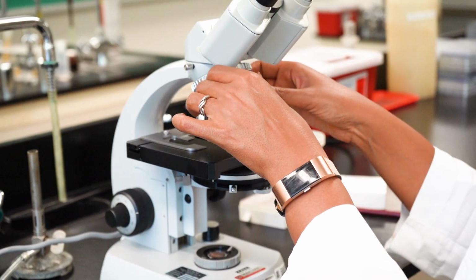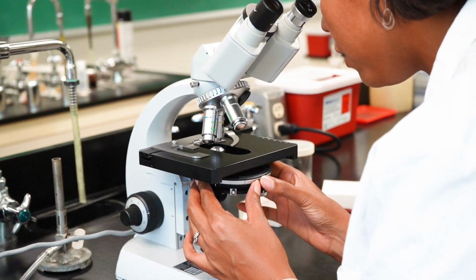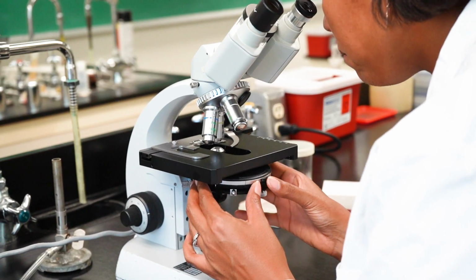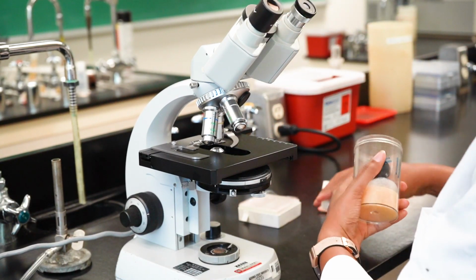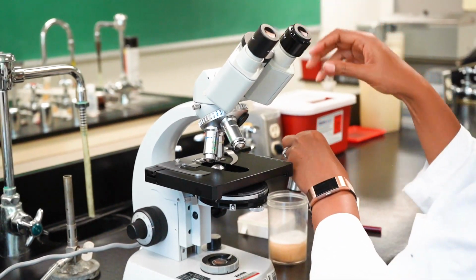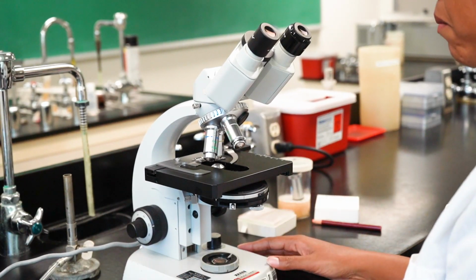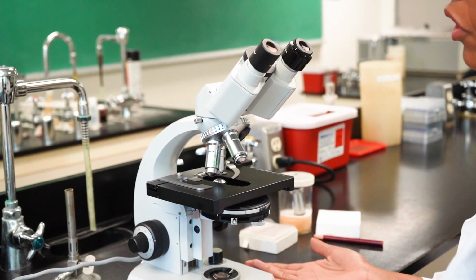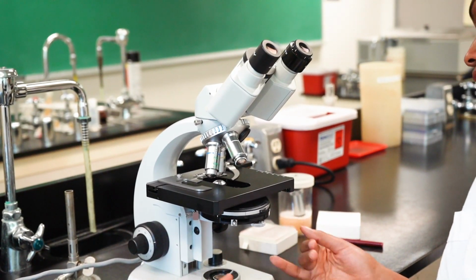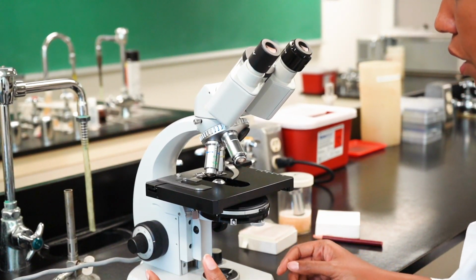But let's say you set up your microscope and you weren't planning to use it for bright field, but instead we're planning to use it for phase contrast. Well, phase contrast is very different from bright field because we have to change the condenser setting for every magnification that we plan to use.